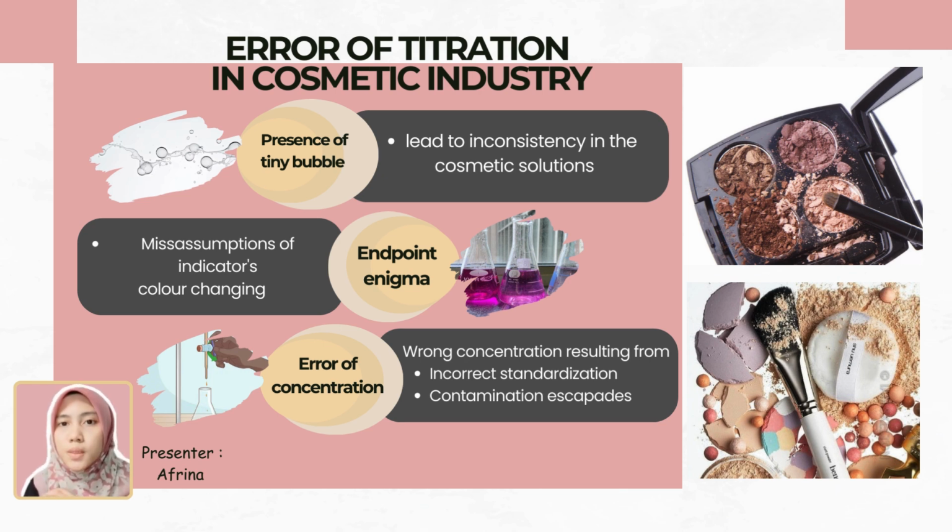What do you understand about endpoint error? It is hard to explain. What is the meaning of indicator? The indicator shows the endpoint by color changing. So the titration error that leads to endpoint error is the misperception of determining the color change in the titration.